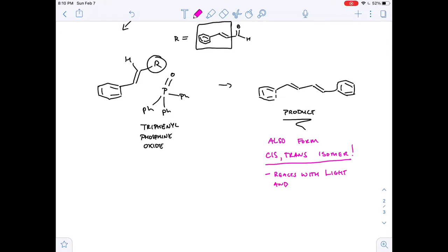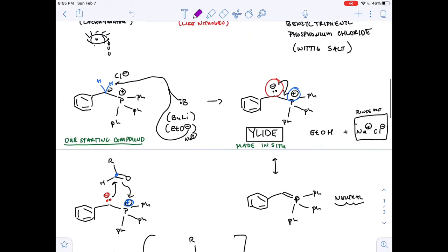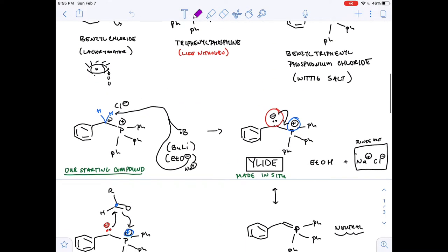So what happens is this cis trans isomer reacts with light and it isomerizes to the trans trans isomer, okay? So remember, cis trans and trans trans, those are diastereomers of one another, right? And so what do we know about diastereomers' physical properties? They're different, even though they look the same, right? Same bond connectivity. So that cis trans isomer is actually going to be a liquid at room temperature because the melting point and boiling point are different. And so we can filter that off with the triphenylphosphine oxide and analyze that with TLC like we do our product.